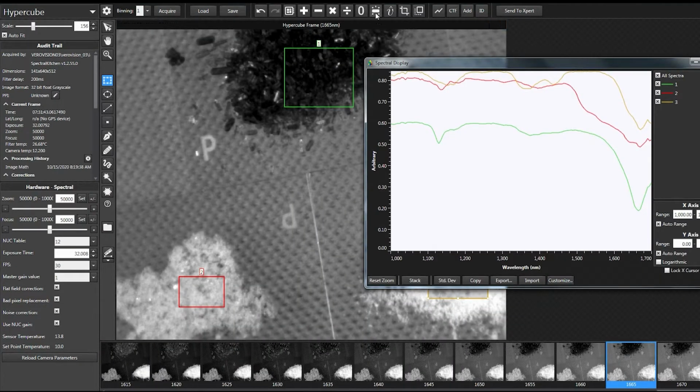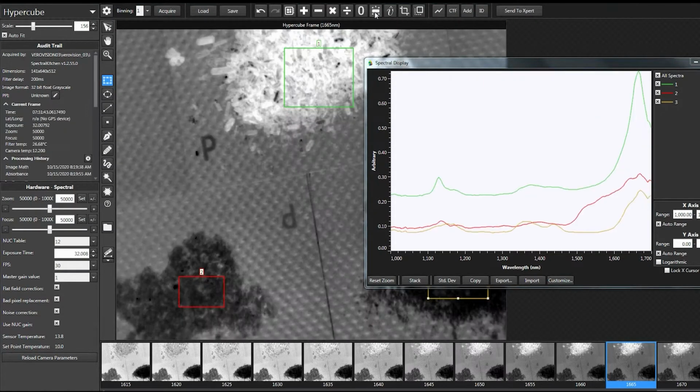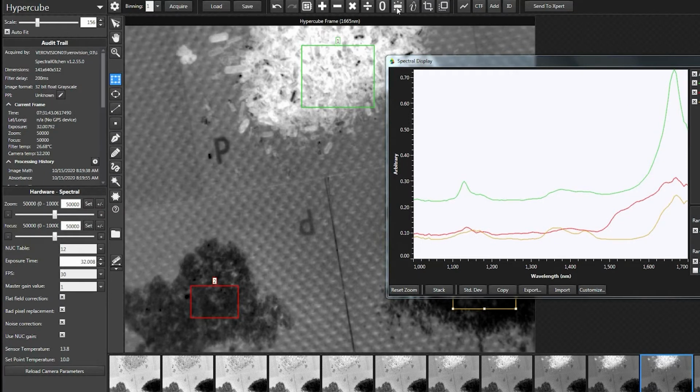Removing the influence of the sensor spectrum from the spectra of the tablet's ingredients is relatively straightforward. This is quickly done by dividing the hypercube of those ingredients by the hypercube of the sensor. The result is spectra in terms of reflectance, which we convert to absorbance spectra for easier evaluation. An initial review of the spectra can be done at this time, noting the characteristic peaks of the Excedrin tablet's 3 active ingredients.